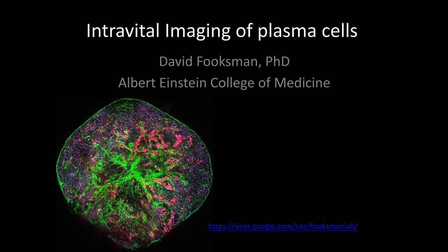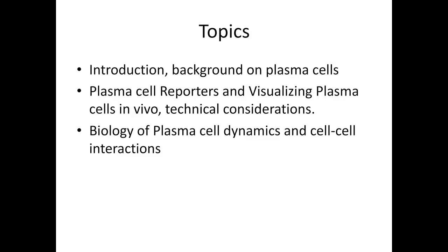And I also want to thank Jordan for the really thorough introduction into intravital imaging. I'll be touching on those points in a little bit more depth, specifically focusing in on plasma cells. So for today's talk, I'll provide a brief introduction to plasma cells. Then I'll discuss tools and reporters for imaging plasma cells in vivo and some technical considerations. Finally, I'll describe some biological insights we've obtained by imaging plasma cells in vivo.